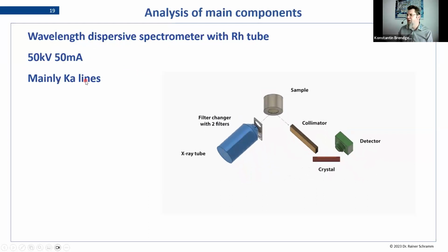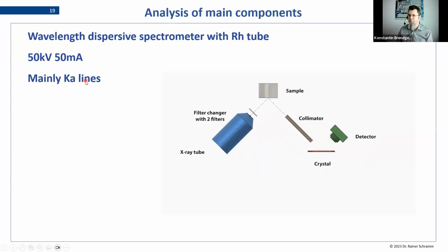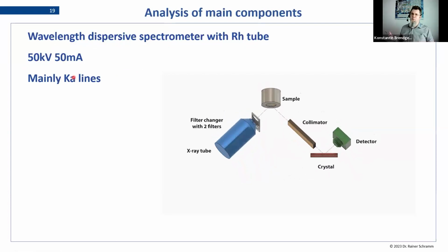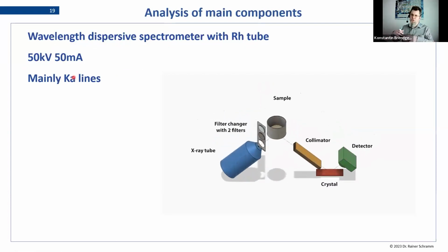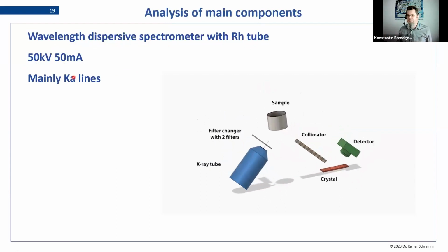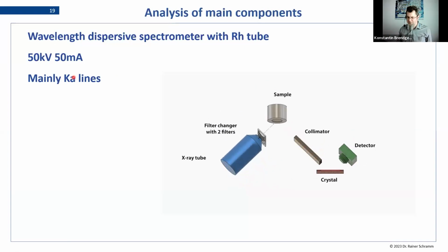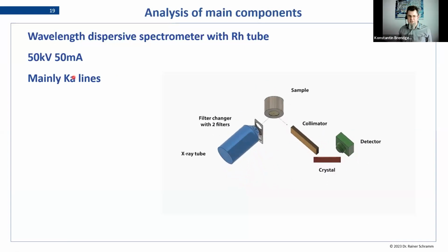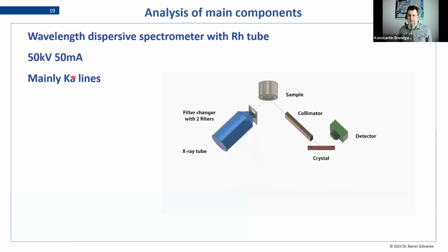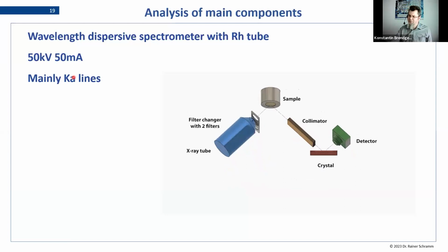And the analytical lines that we choose for these applications are mainly the K alpha, so the strongest one. We can use those because, again, we have a high dilution. And for some elements, like, for example, strontium, we are even using an L alpha, a weaker one for analysis, because it gives us enough count rate even on the diluted sample. So that's your typical application program. But again, it's only half of the analysis and the report.